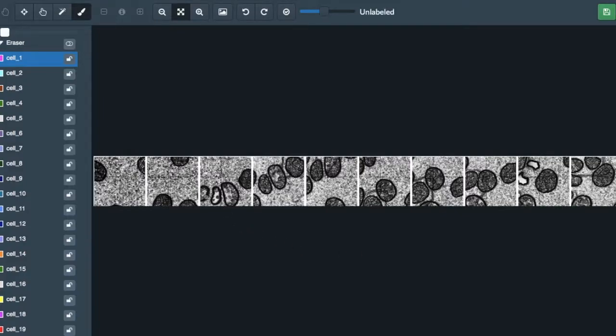In these images, the cells generally move upwards across the frames, but can move rather quickly, occasionally making their paths difficult to track. In this case, just try your best to estimate the paths of the cells. In order to label the cells, you will have to color in each cell in the image, keeping colors specific to the cell. So, for example, this cell might be colored red throughout the film, while this cell might be colored green.